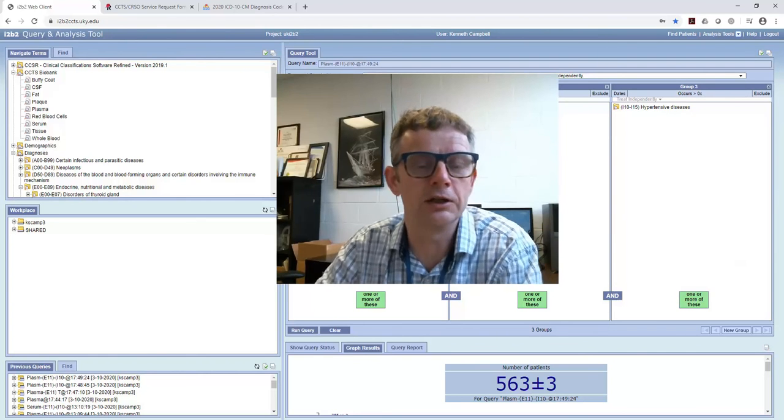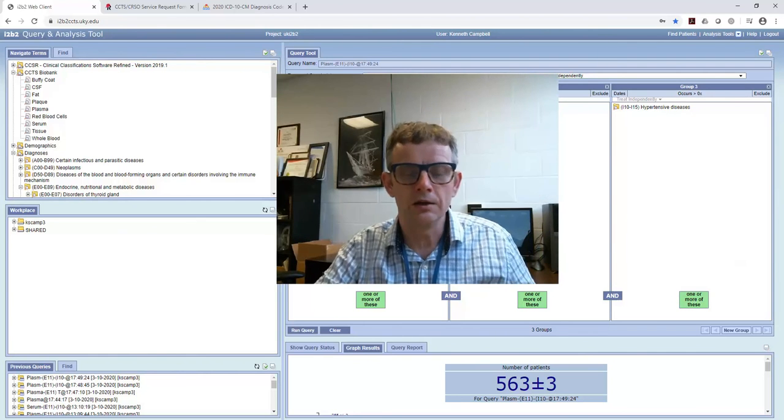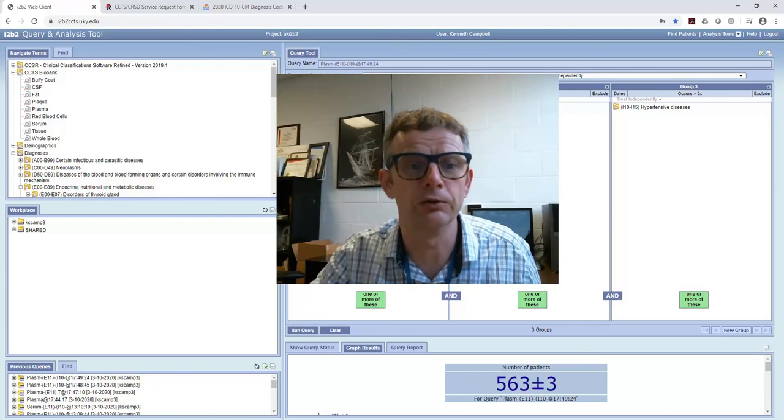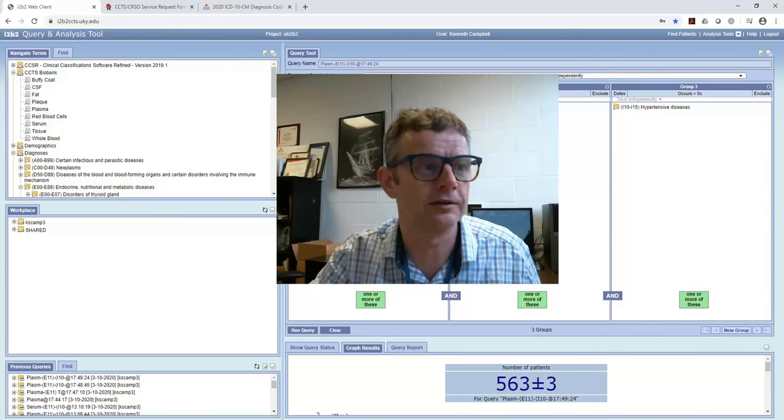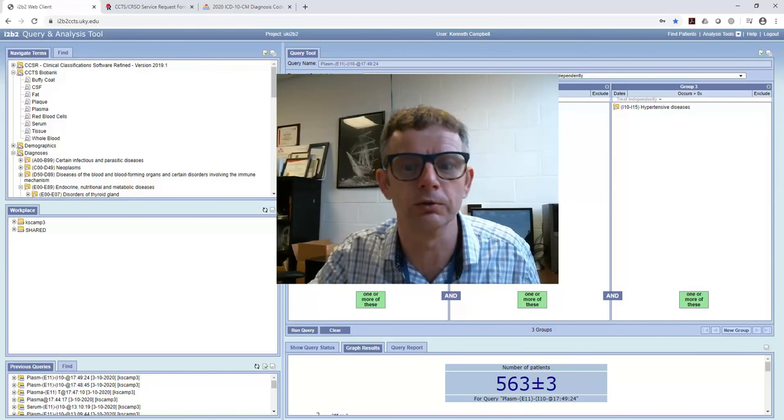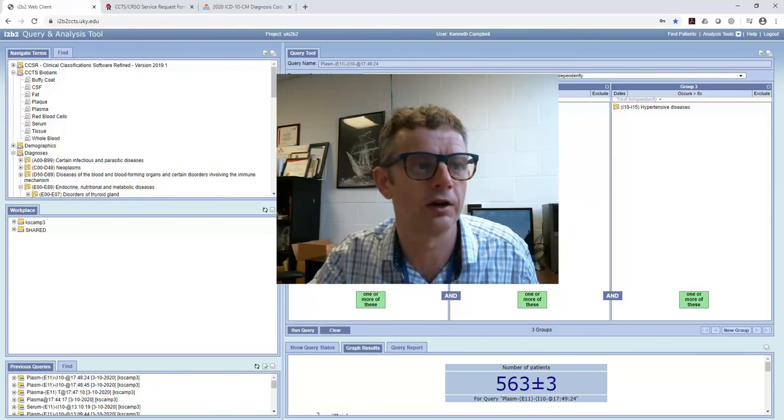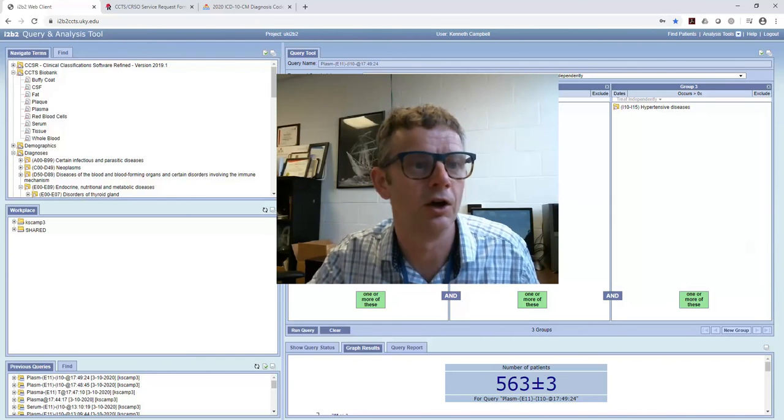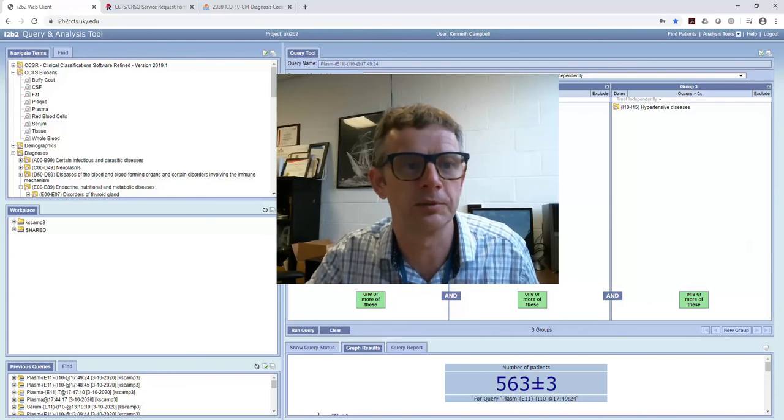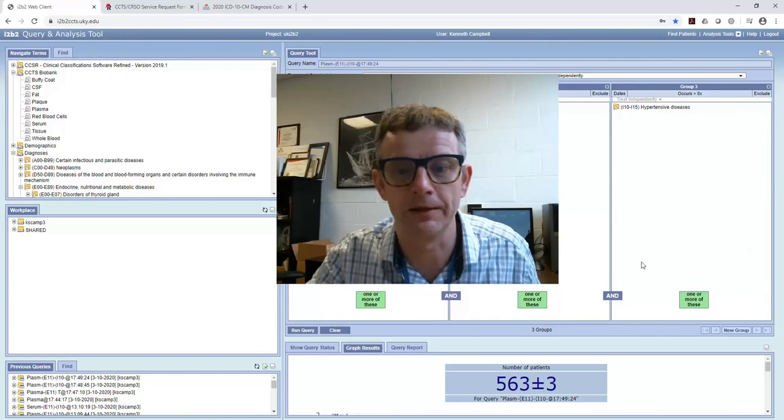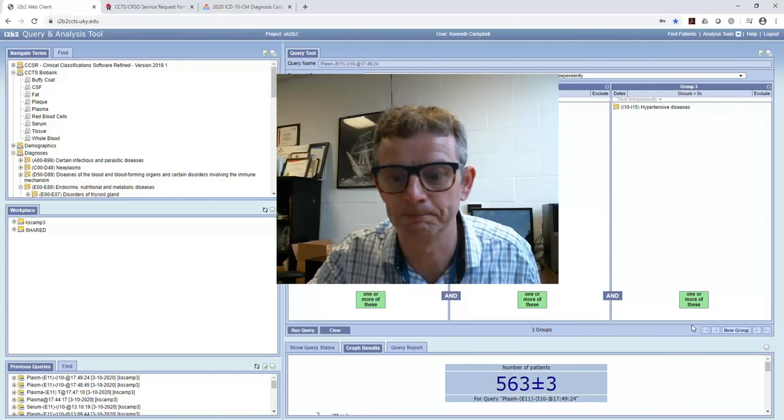And so that's a pretty good way of helping you to see how you can use online tools to search the inventory of the CCTS biospecimens core at the University of Kentucky. Thank you for your time.